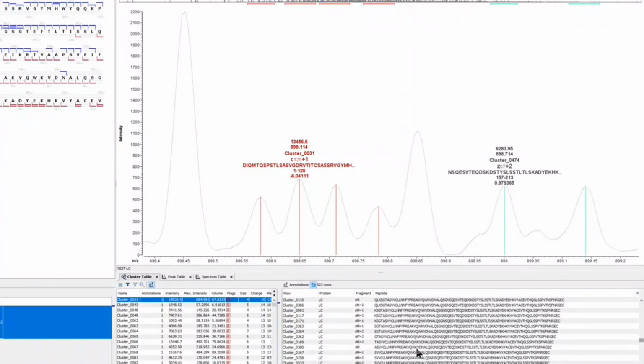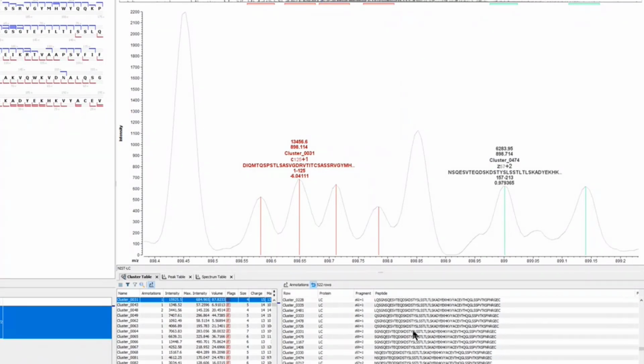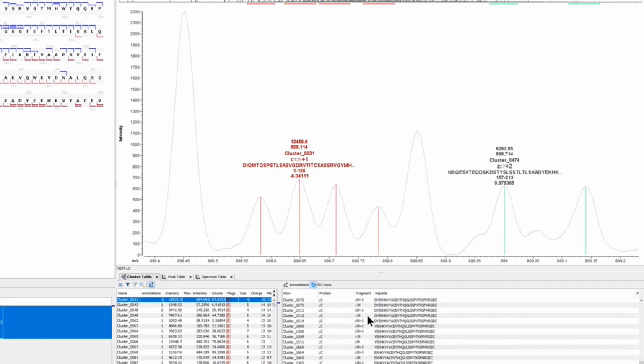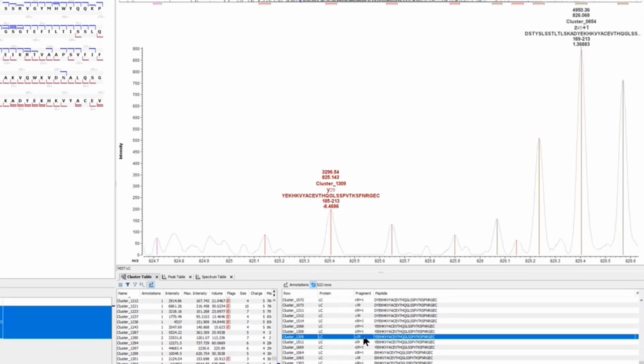I've got my notes to make sure I cover what I wanted to cover. I'm just going to scroll on down. There was one I cherry picked here. All right, so this one is the example I wanted to cover. I wanted to look at this C-terminal 29. So there's a few actual pieces of evidence here, right? There's a Z29 plus 1, another in a different charge state. There's a Y ion that it's found.